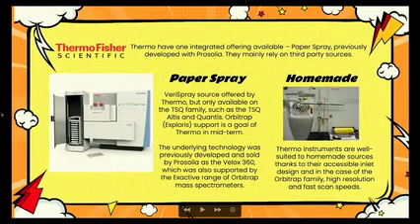On to Thermo. They have the VeriSpray source, which started life once upon a time as the Prosolia Velox source. When Prosolia IP was bought by Waters, the Velox stuff ended up with Thermo, and that was developed as the VeriSpray.